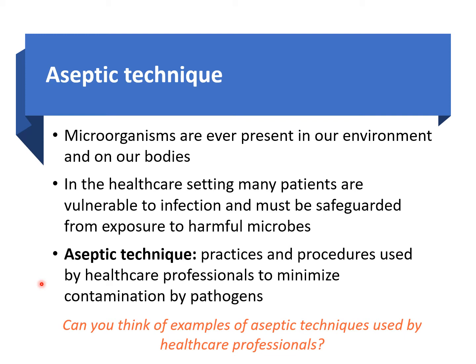By these pathogens. Now, these aseptic techniques are not just used by healthcare professionals, but also in a lab setting, especially microbiology lab settings. We also have to follow those aseptic techniques so that students can protect themselves from getting exposed to the microbes that are used in a lab setting.